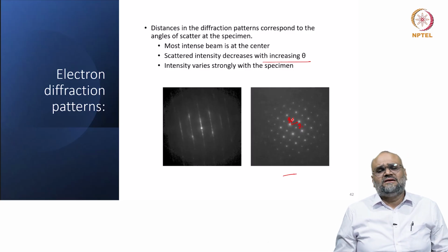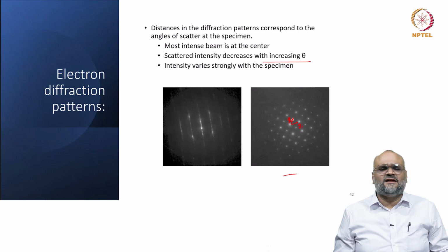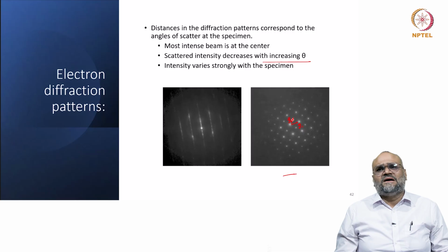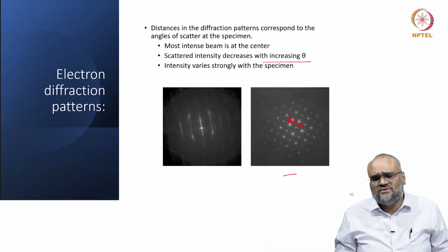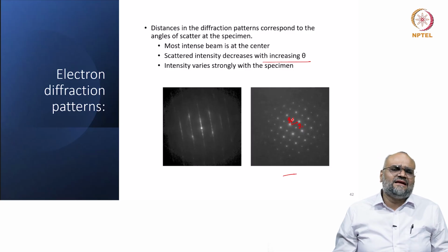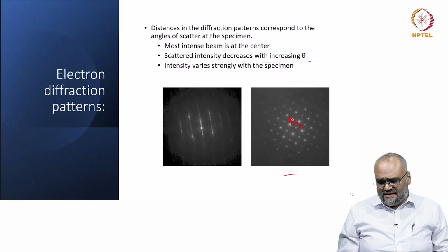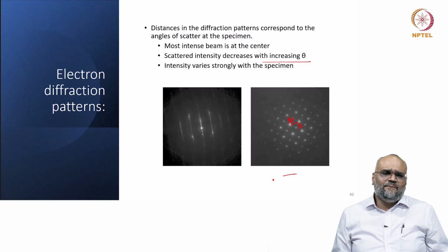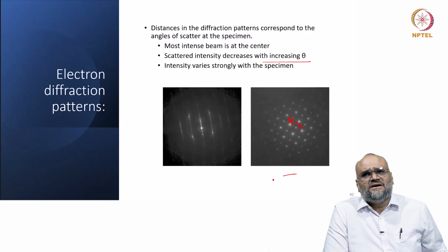When I talk about solving the crystal structure and obtaining crystallographic information, I would say the transmission electron microscope is extremely important to understand the symmetry, the positions of the atoms and the crystal structure information, but it is a very localized technique. Often complementing this with an X-ray diffraction study gives you the complete information on crystallography from a material.